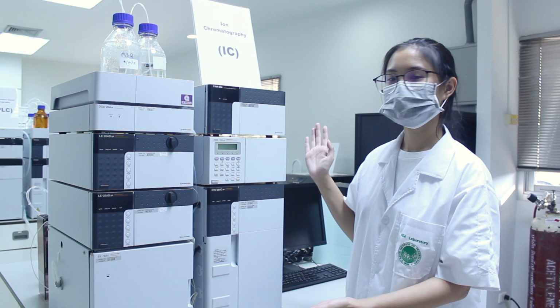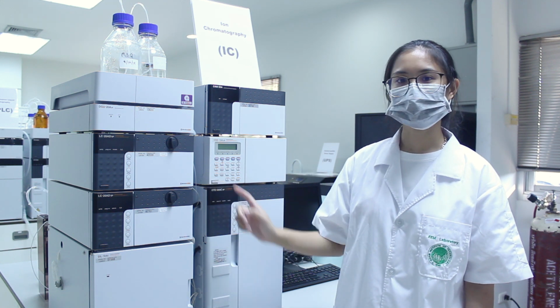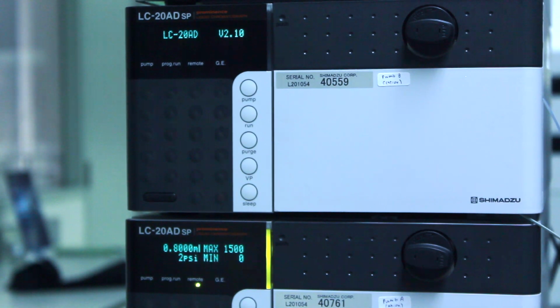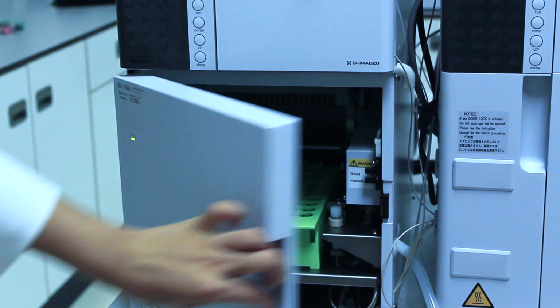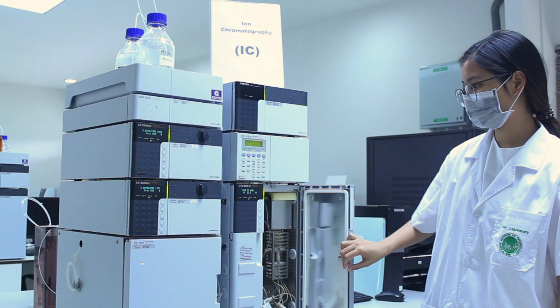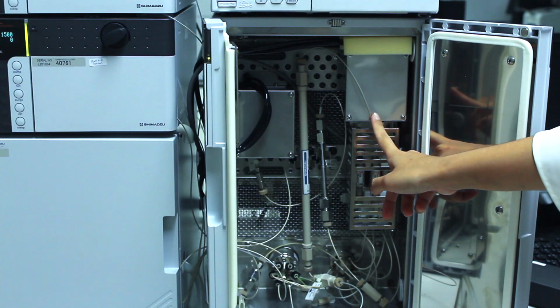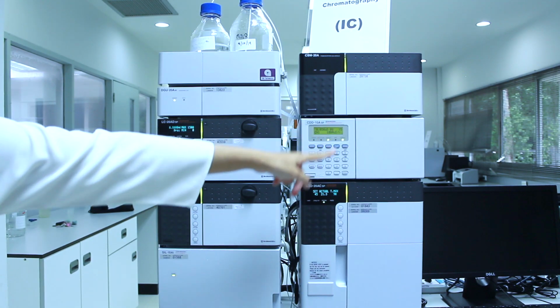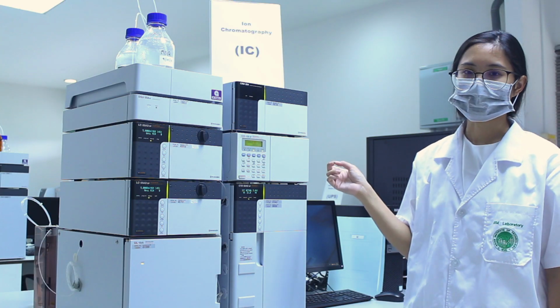The ion chromatography that we have at IDEA R&D Center is a Prominence ion chromatography of Shimadzu LC20 series equipped with an online degasser, two solvent delivery pumps, an autosampler, a dual flow-line analysis system in a column oven, a suppressor, a conductivity detector, and a system controller for the communication with LabSolutions programs.